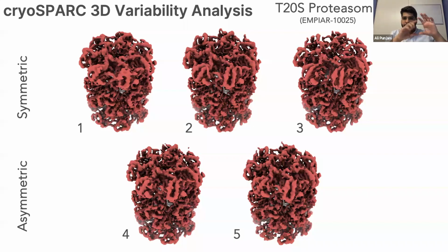Like if you think of all the variability components from the first one to the last one, the first ones will have very large variance that they're explaining. And then that variance will shrink, hopefully quickly, explaining all of the actual interesting things that are happening in the data set. And then all of the other components will be capturing the variability due to noise. And so at some point, the variability components end up being just noise. And we would ideally want to be able to detect that when the variance drops below a certain quantitative amount. We haven't got to that point of actually developing that threshold or figuring out how to compute that exactly right.